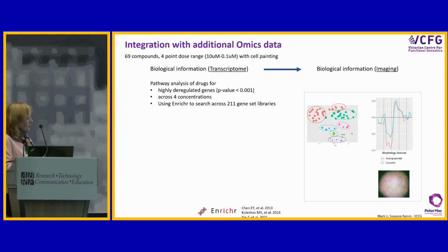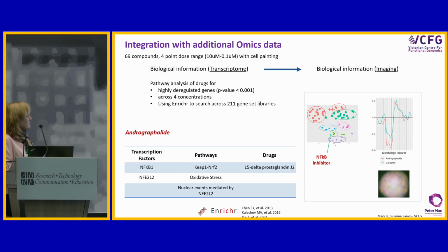This is a very stylized diagram here of what happens next. We were looking at pathway analysis, but actually we picked out NF-kappa B as differentially expressed target, which are the targets of this compound here. So again, all little steps, known agents, but still giving us something that says this method's going to work.